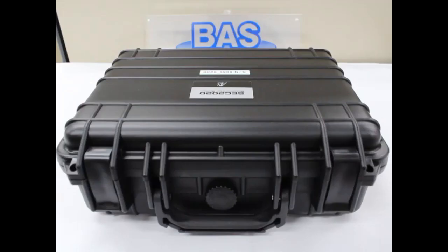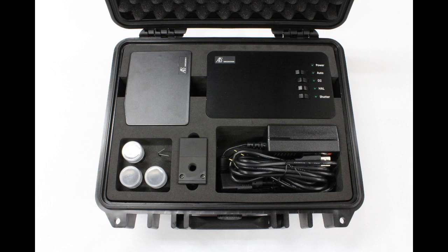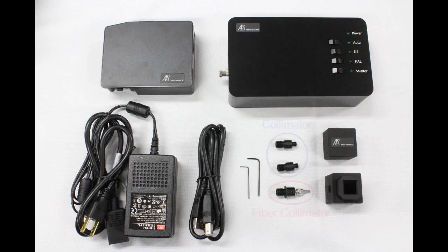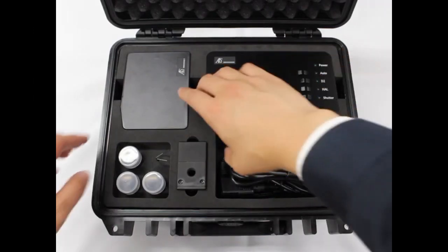The system is stored in a waterproof case. In the first level, you will find the spectrometer, light source, cuvette holder, collimators, power and USB cables. There are two types of collimator: two collimators and one fiber collimator.